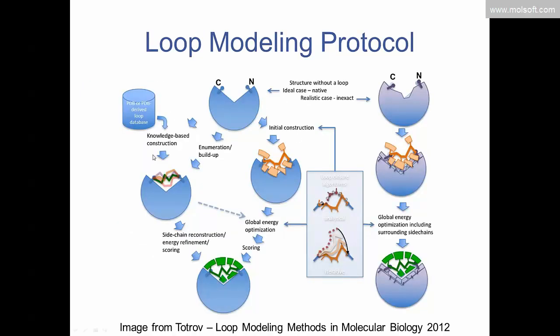So this is a slide taken from Max Totrov, our principal scientist, from his chapter in this Modeling Methods in Molecular Biology book. And it shows some different approaches that you can use in ICM for modeling.